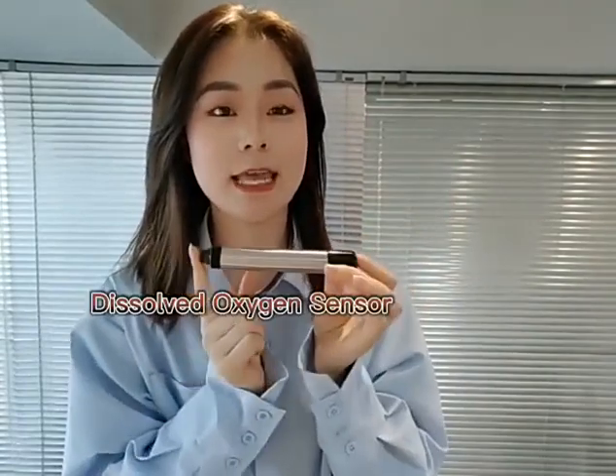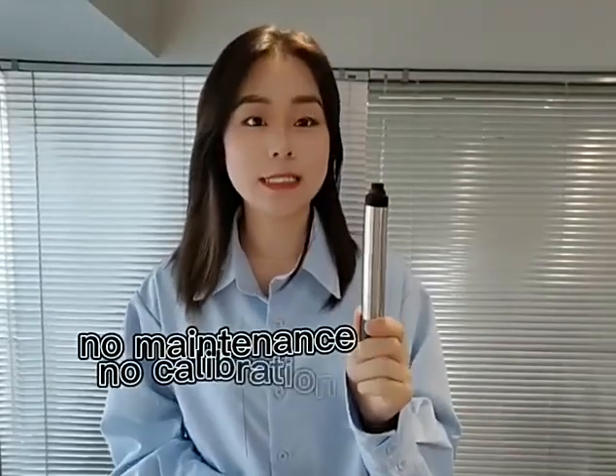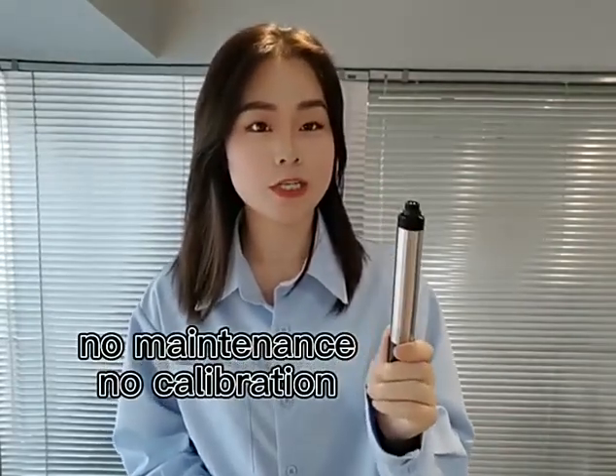Yes, this is a dissolved oxygen sensor. As you can see, it's small in size and easy to hold — I can hold it with just two fingers. It has four features. The first one: it has no maintenance and no calibration, with excellent stability and high accuracy.